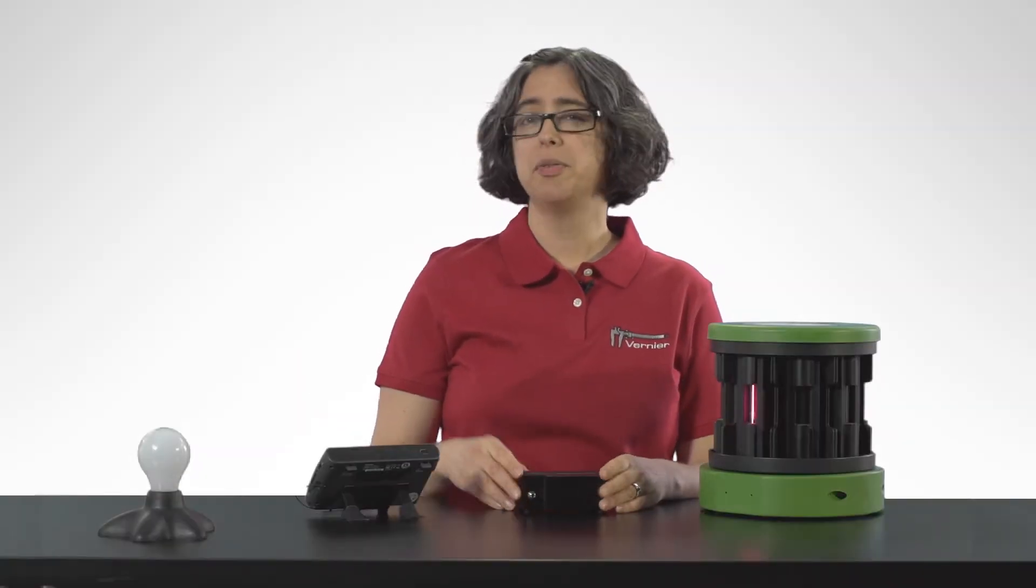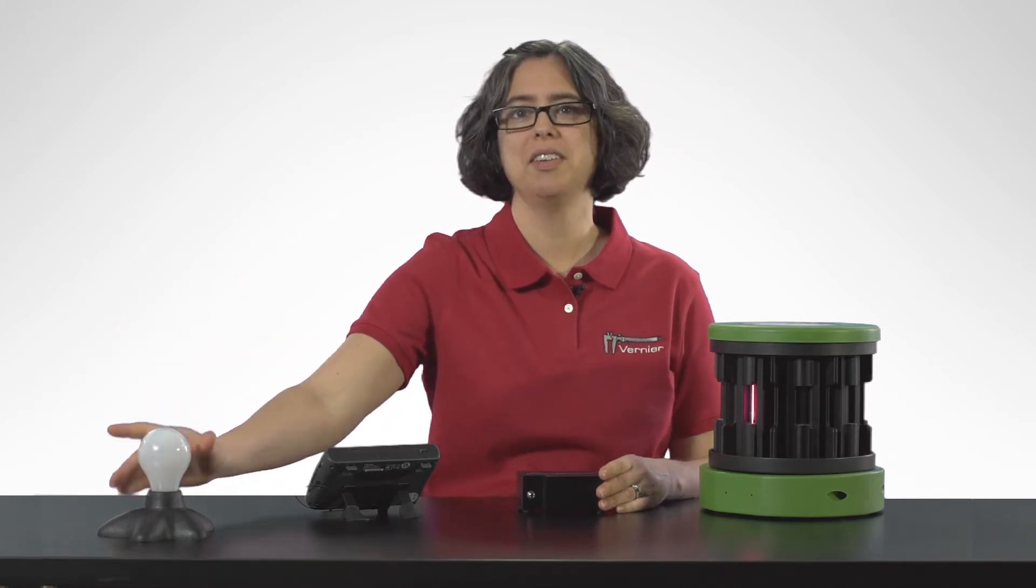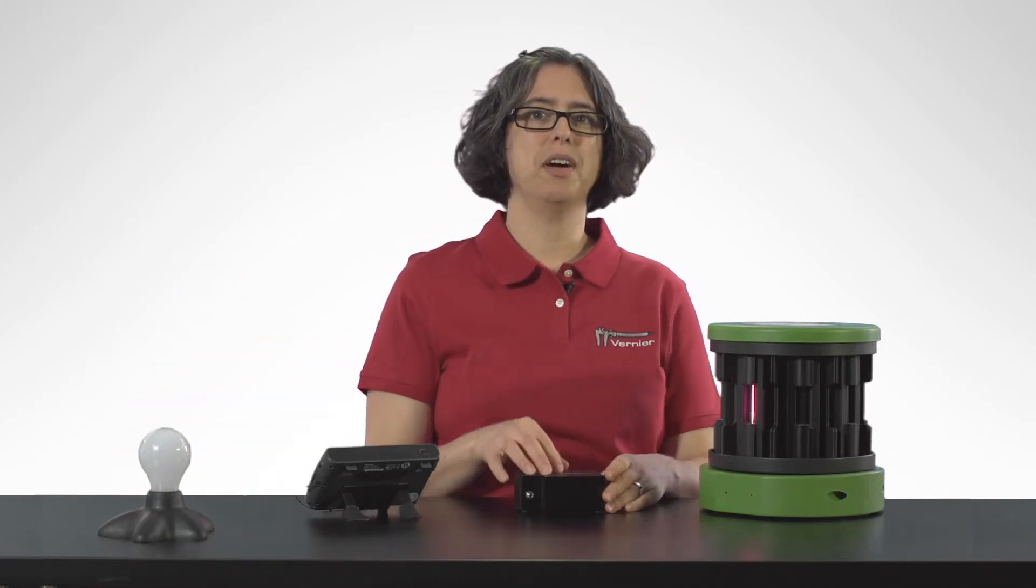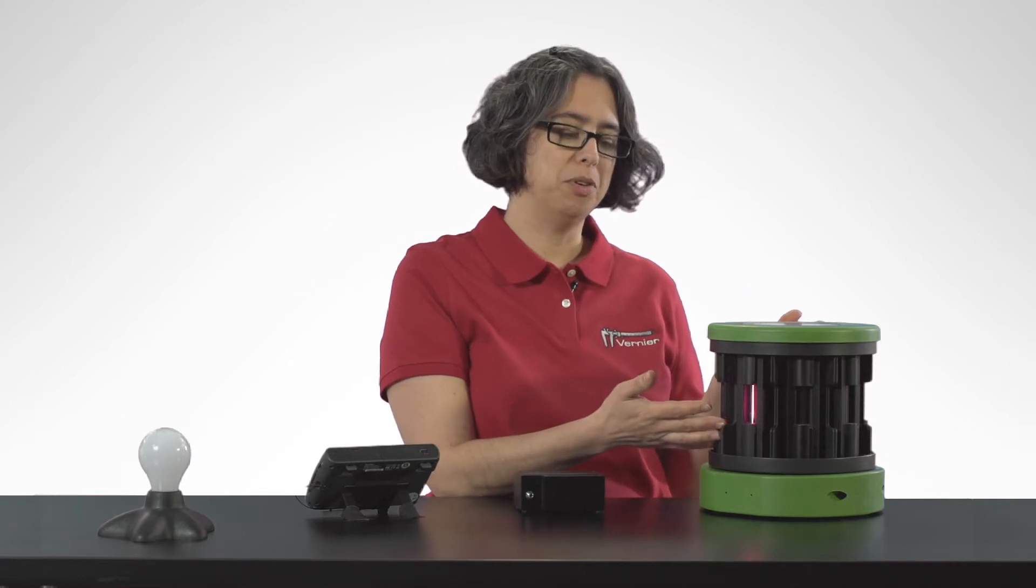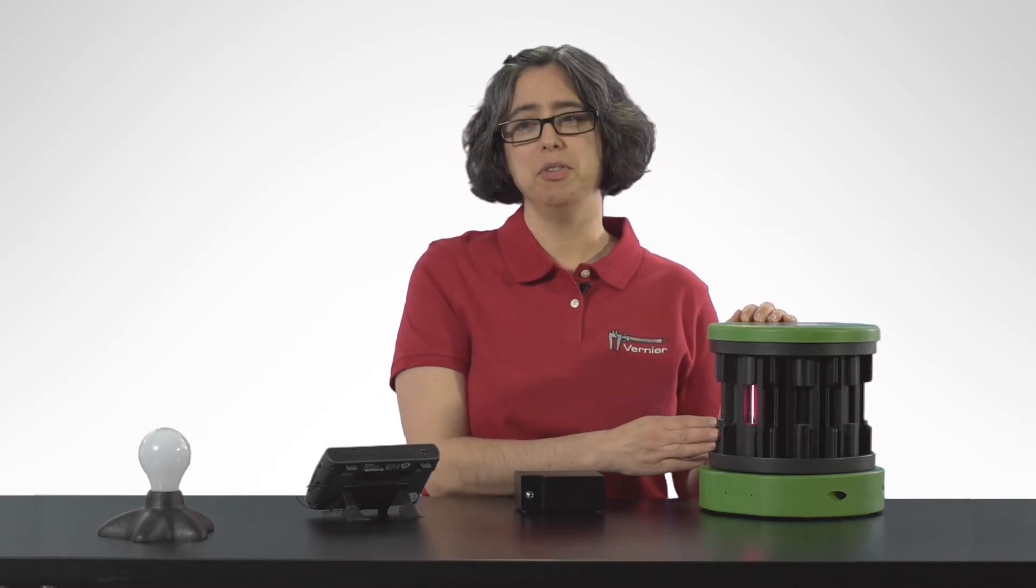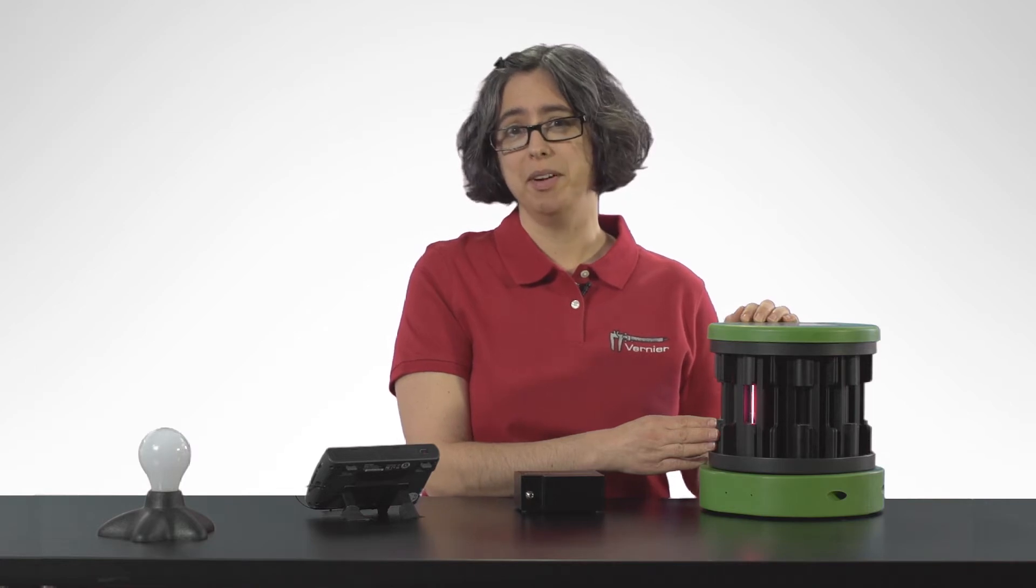It can be used for comparing the spectra of different light bulbs or LEDs, or for examining the spectra of different elements using gas spectrum tubes. We have some here in our spectrum tube carousel, also available on our website.